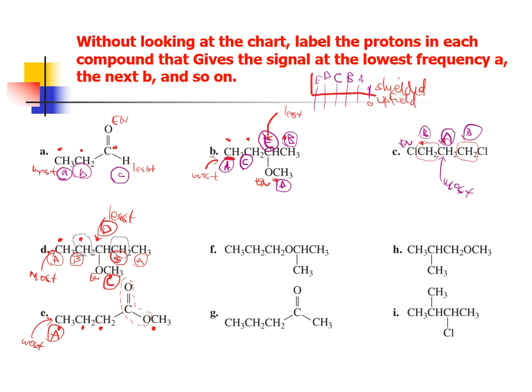In other words, it's closest to the 0 mark, like all the other examples that we talked about. So next in line would be this CH2 group, right? I'm getting closer and closer to that electronegative area. So this is probably going to be B. And now we're going to take a minute and pause and think about this.